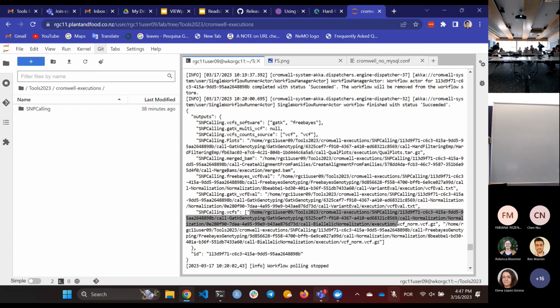Important, so you miss the... So we just read it like the thing that we did before, the outputs, we just go into the... In the middle, how? This one? No. And then you open that one.